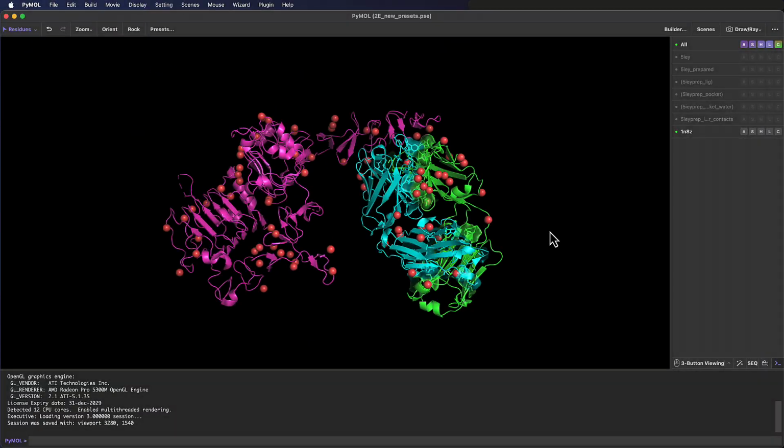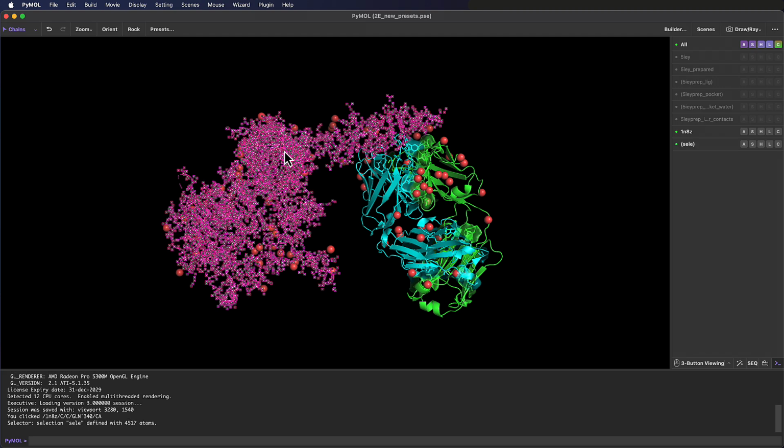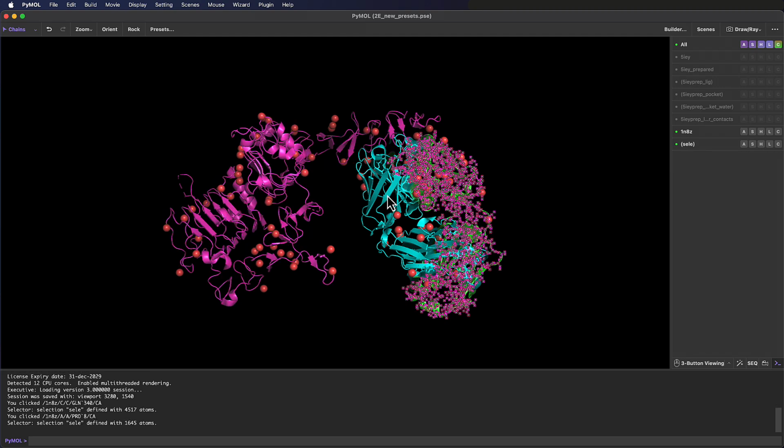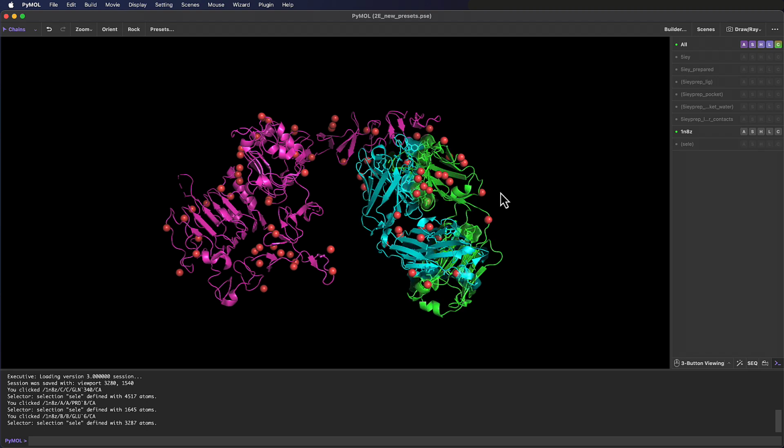To make a more scientifically interesting edit to our Protein-Protein Interface preset, we could do something like highlight only the protein-protein interactions between the antibody and antigen. This requires some knowledge of our structure, and for 1N8Z, the C chain is the antigen, and the A and B chains are the light and heavy chains of the antibody, respectively. The antigen binding fragment, or Fab region, of this multi-chain antibody is the therapeutic agent here, with the proprietary name Herceptin, or generic name trastuzumab.